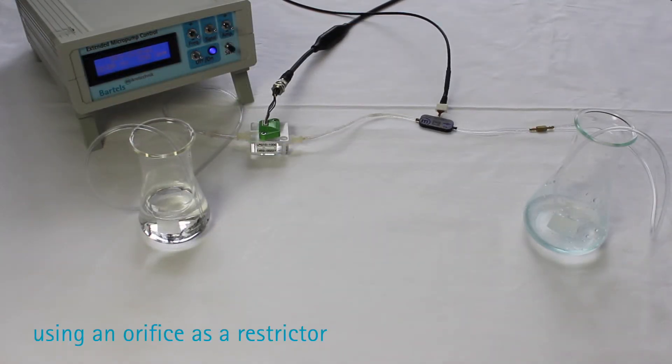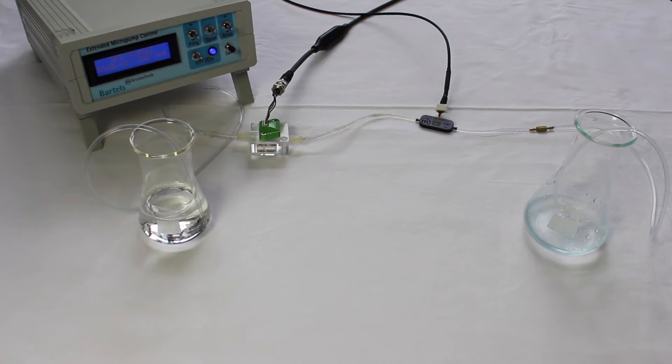It is crucial to select the right restrictor, one that will fit the needs for your application. One way to restrict the flow rate is with an orifice. These come in preset dimensions, diameter and length, and it may not be possible to find an orifice for your specific flow rate.